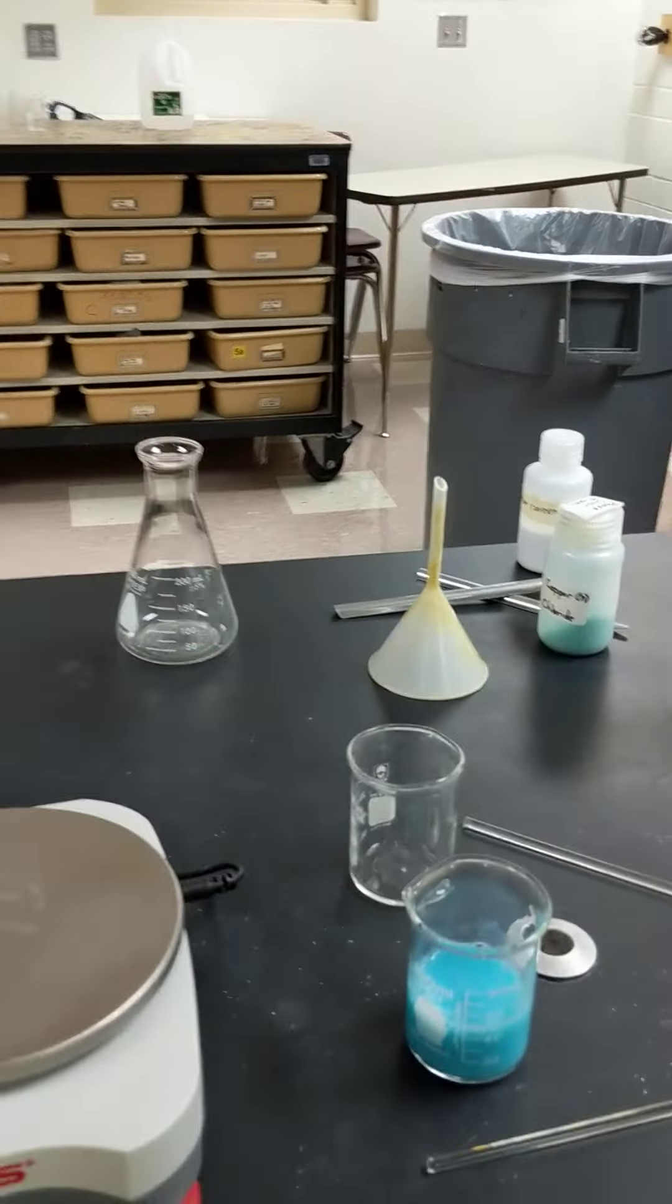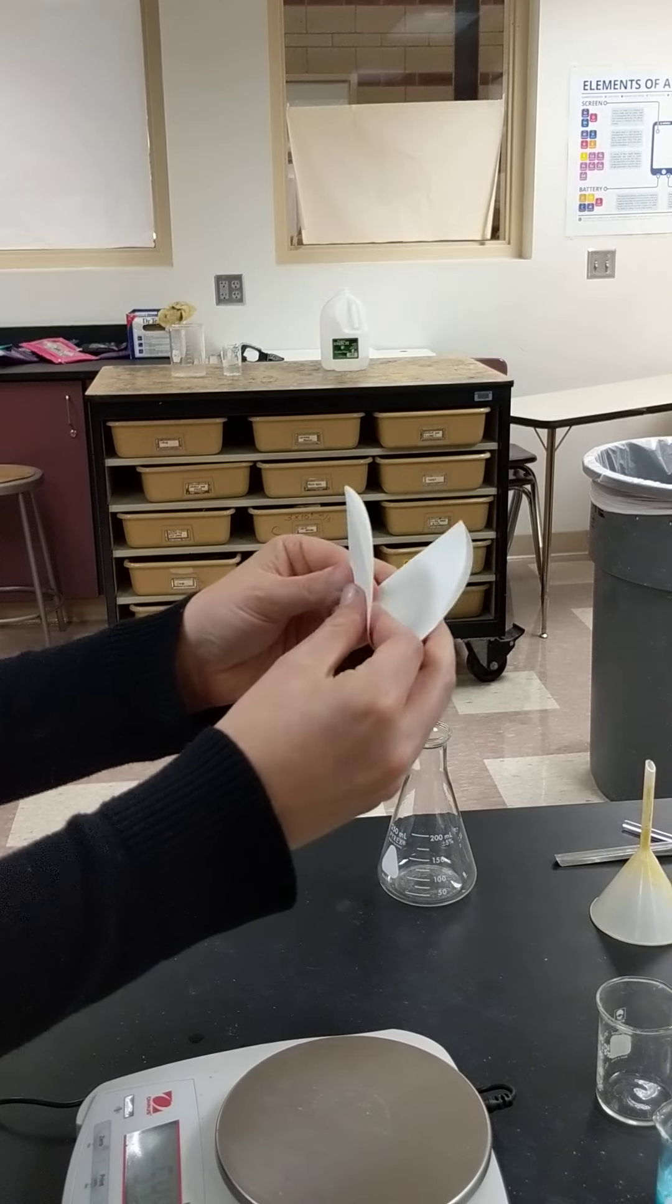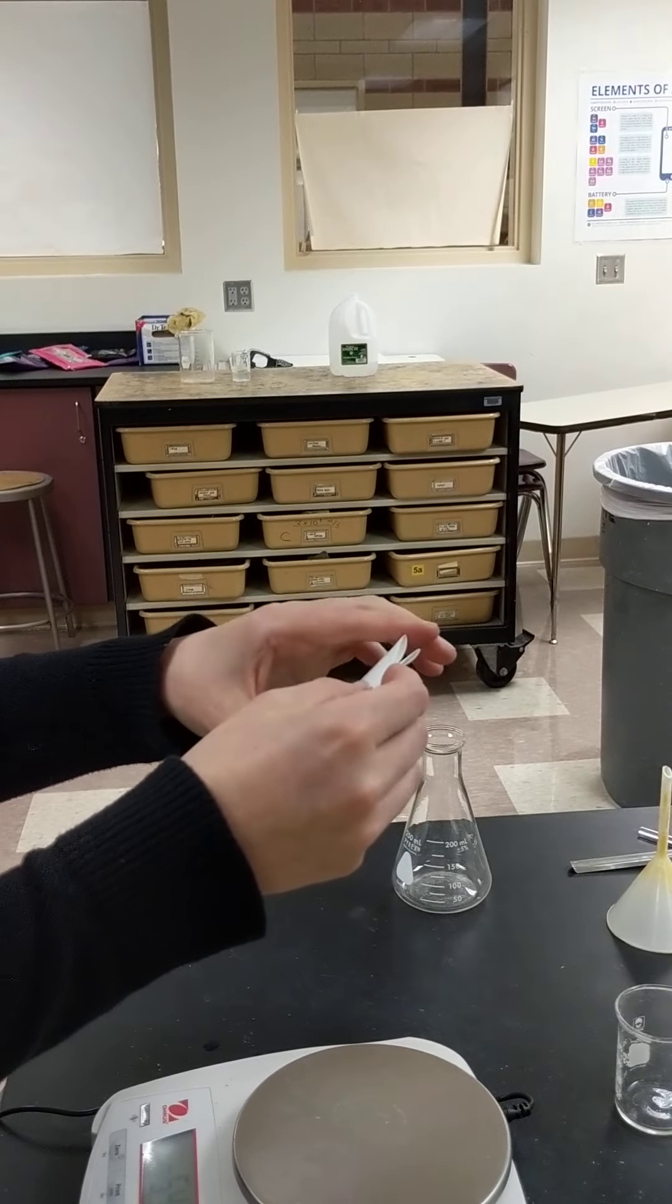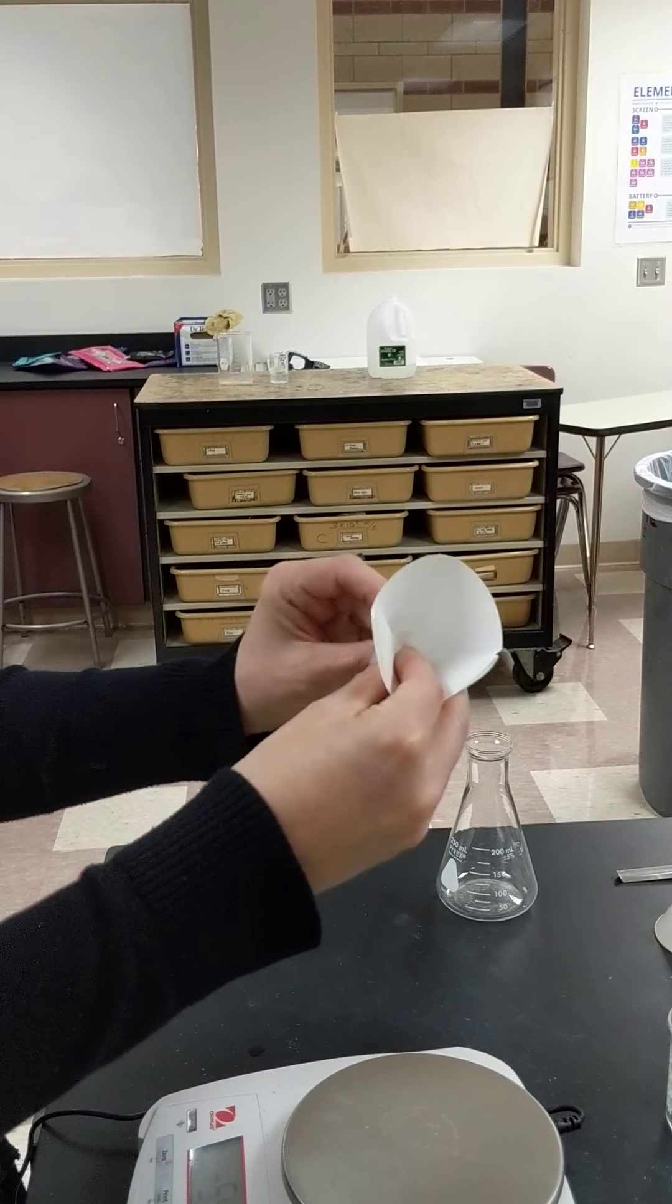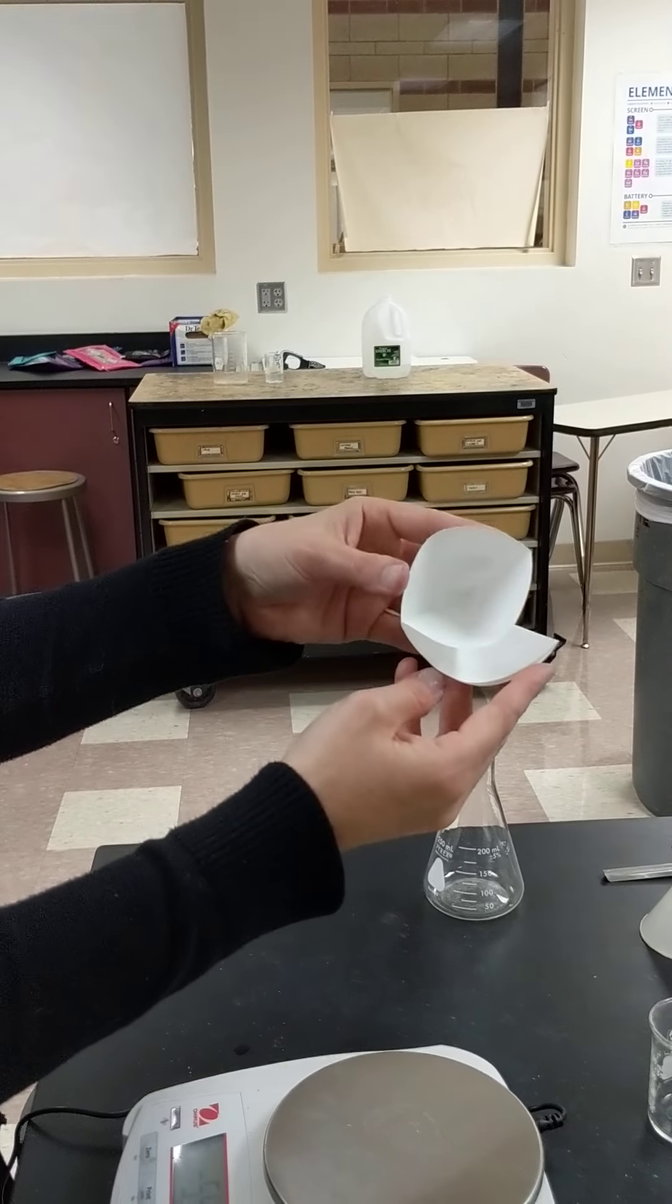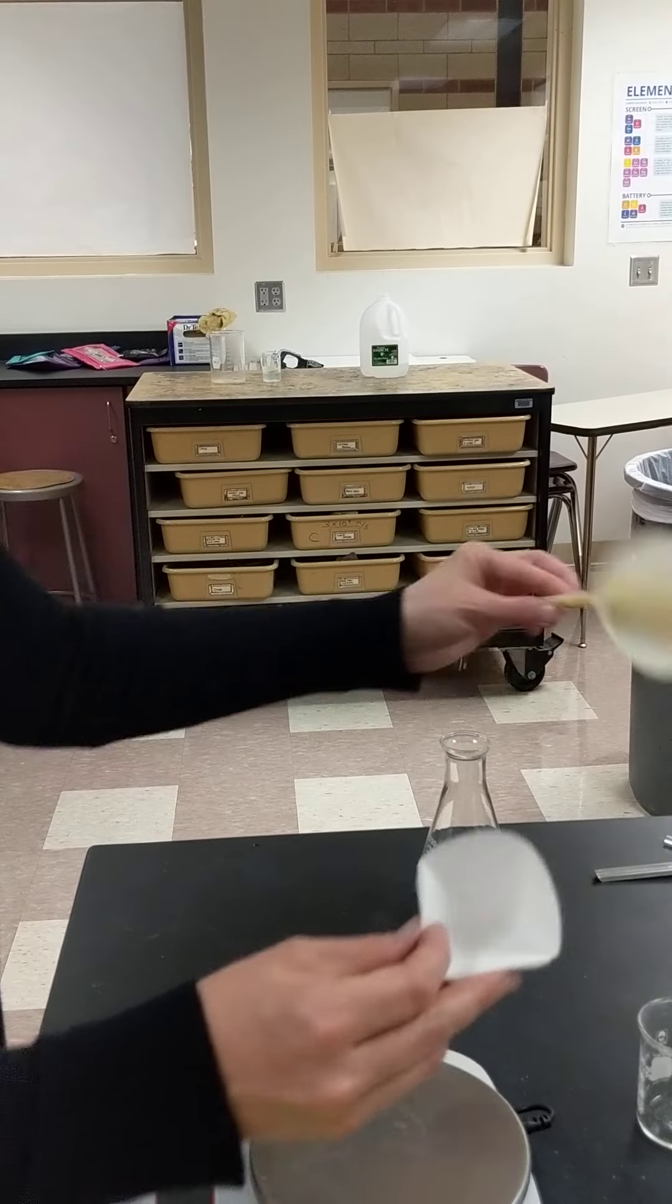So we're going to take filter paper and we're going to fold it in half. And we're going to fold it in half again. And this makes a little cone like so that we can fit into a funnel.